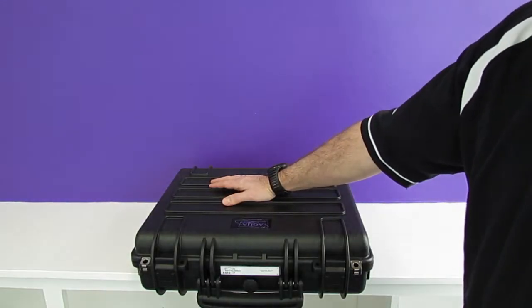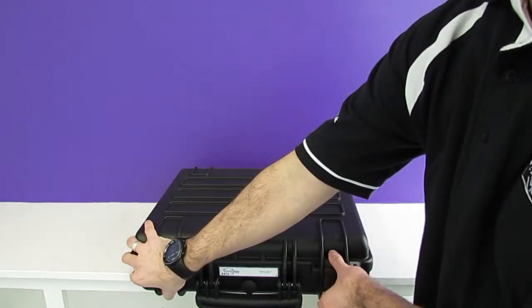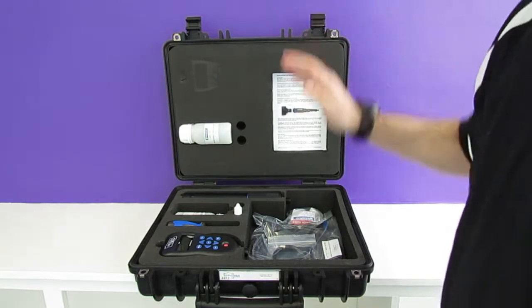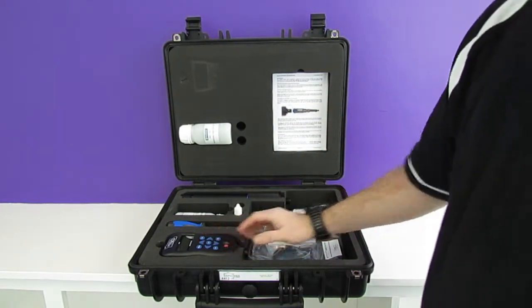This is our AP2000 package. It's available for purchase and also for rental. It's a complete set and features everything you need to get monitoring in the field.